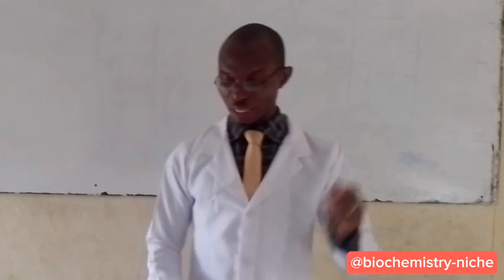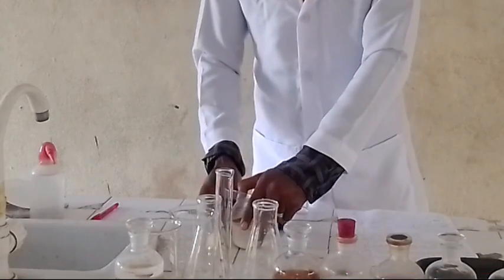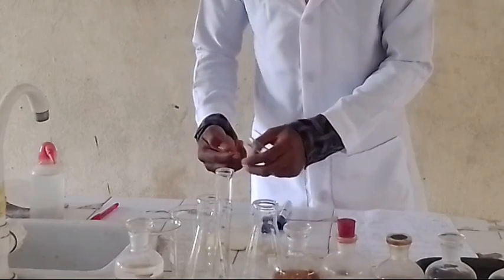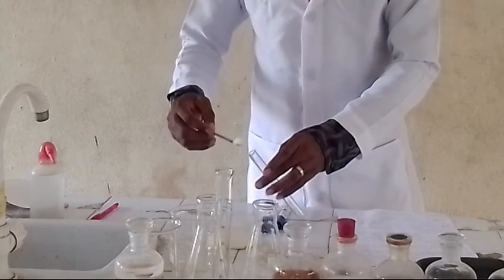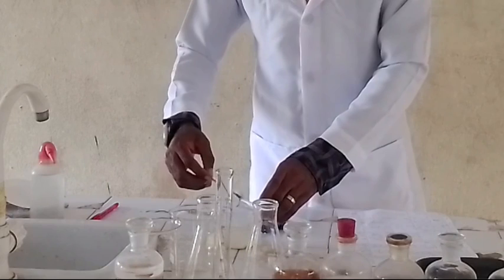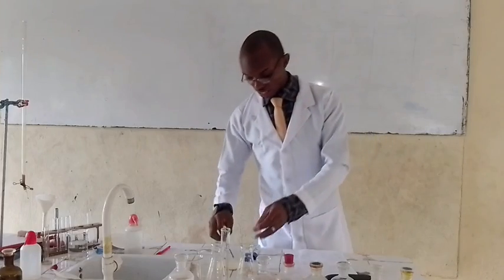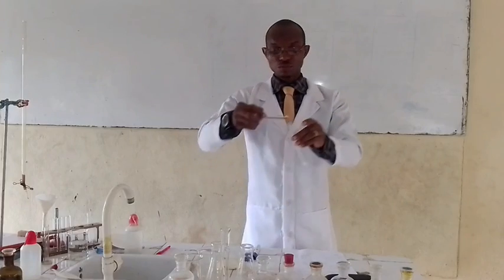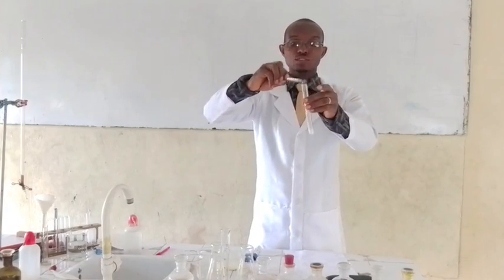I am going to take some samples of Sample C into my test tube. I am taking a spatula of Sample C and adding it into my test tube. We can see Sample C in the test tube. Let me just add a little more. I now have Sample C added into the test tube.